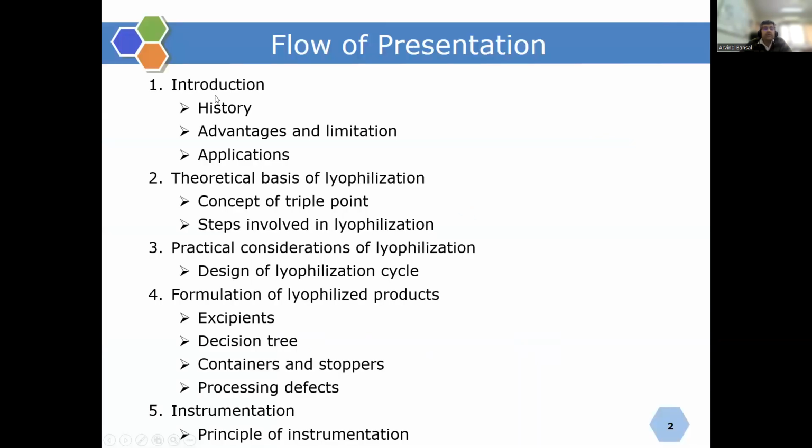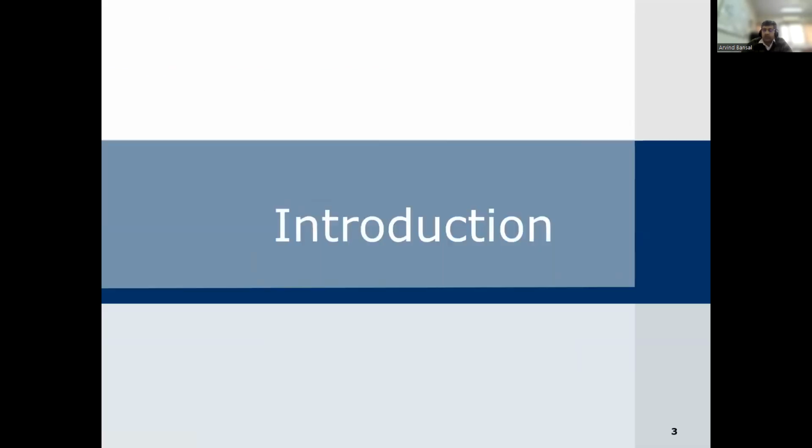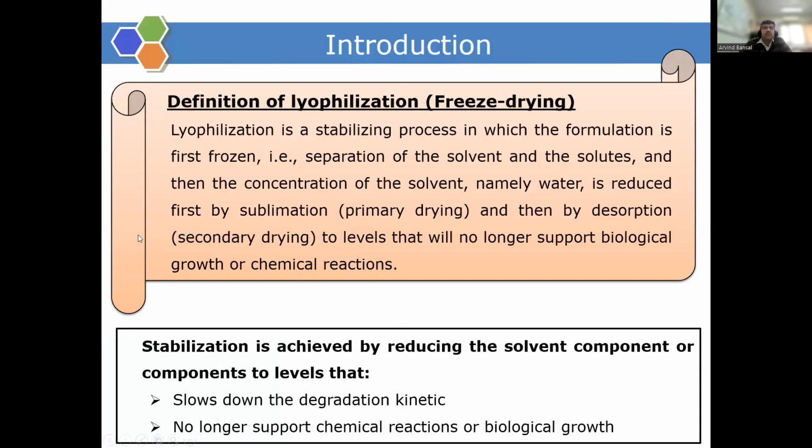We'll discuss the introduction, the theoretical basis of lyophilization and practical considerations, formulation of lyophilized products, and the instrumentation that is used in lyophilization. Let us first start with the introduction to lyophilization.